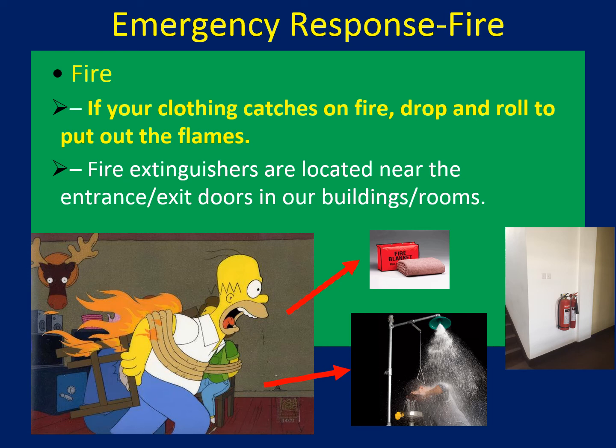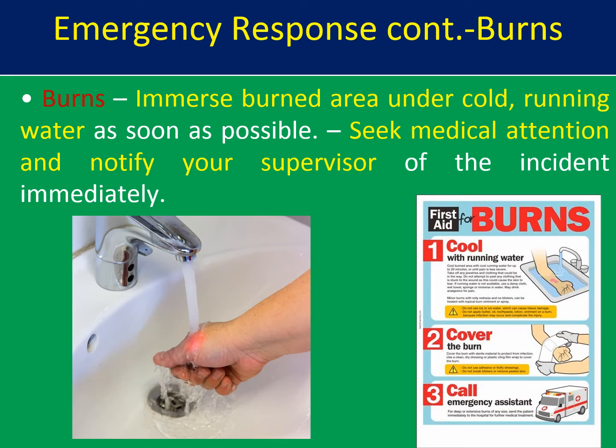We have the safety shower, so that's why I told you at the beginning we can use this safety shower in case of an emergency like a fire. So the pathway should be clear to reach the safety shower, and the safety shower should be working properly. In case of burns, like on your fingers, your body, or whatever the place, immerse the burned area under cold running water as soon as possible, for at least 10 to 15 minutes. After that, notify your supervisor. In the worst case, seek medical attention immediately.